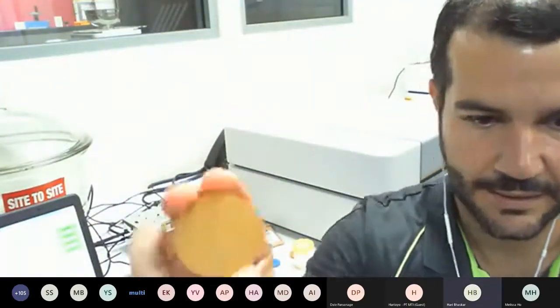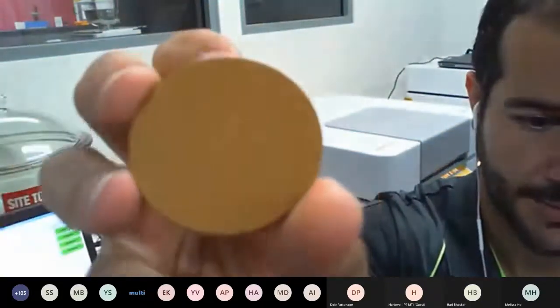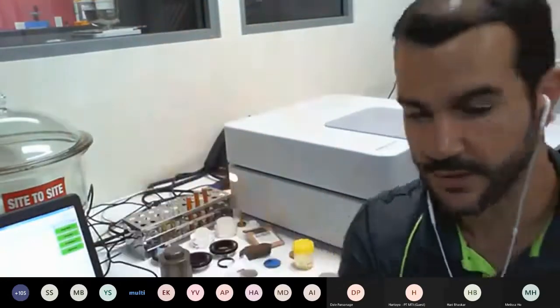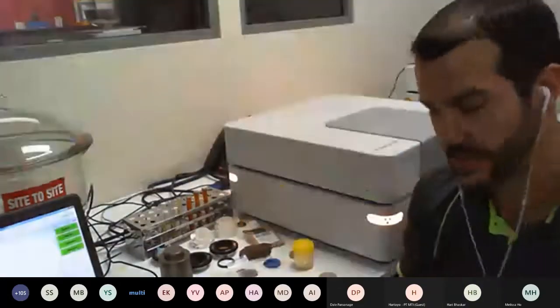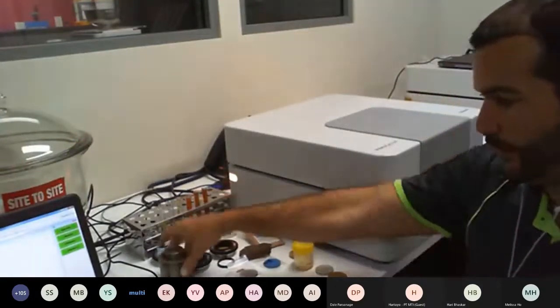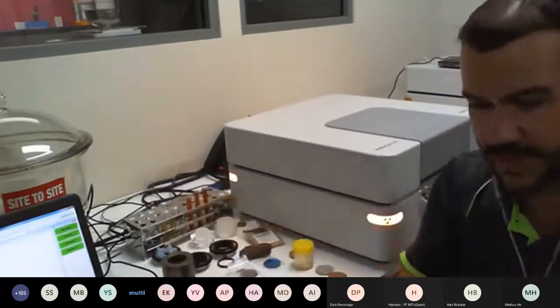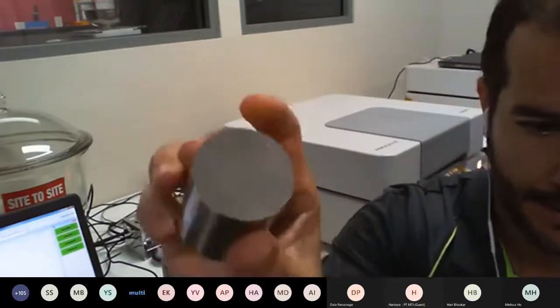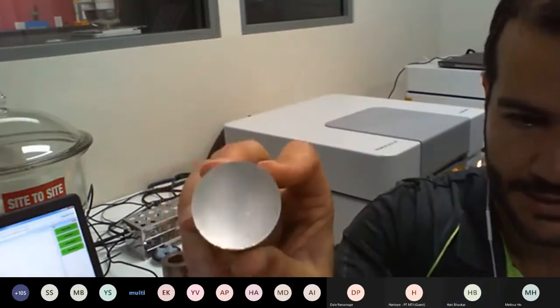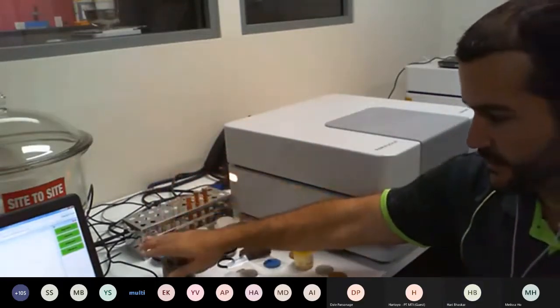Whereas on our nickel samples here, these are actually really fantastic samples. They're nice and small particle size, it's very consistent. And so that's given us a nice flat and smooth sample surface for our analysis. And so all these things will help improve our accuracy. It's also very important that we maintain our pressing equipment. So this is the plunger out of my press, and you can see it is polished to a mirror shine, and so that is kept in good condition.